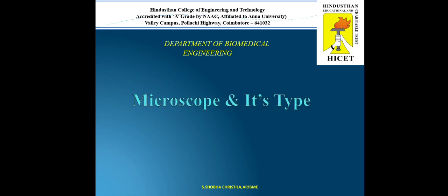Now we will see the topic microscope and its types. Let's get into the topic.